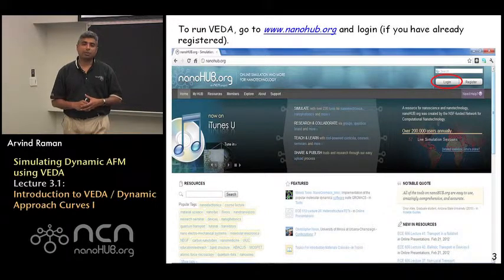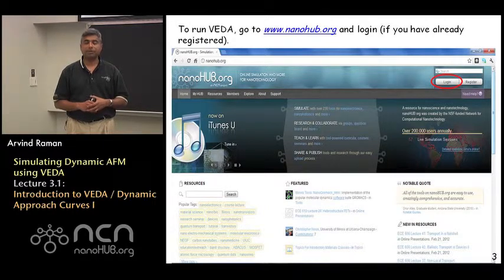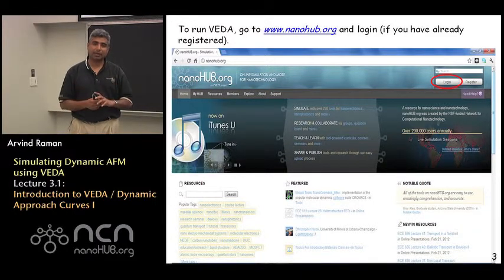All of you are probably already registered on nanohub.org on VEDA, which is a virtual environment for dynamic atomic force microscopy. Those of you who've taken part 1 have gone through VEDA, but for the benefit of those who haven't, I want to quickly reiterate how you access the tools and how you navigate through the layout of the graphic user interface.